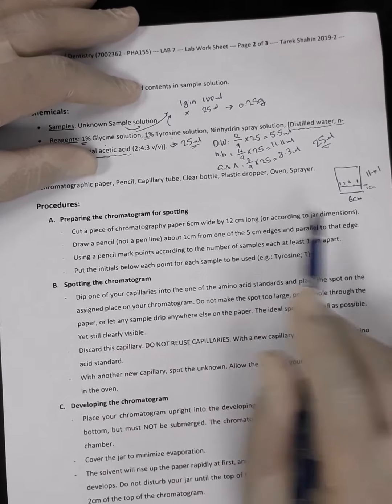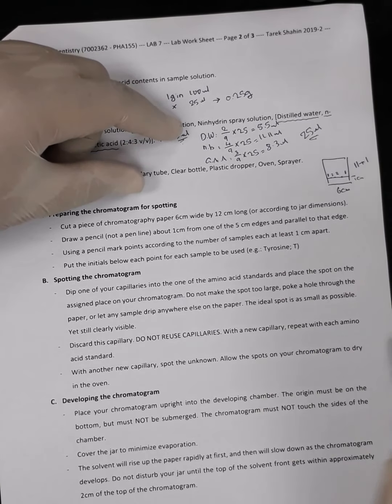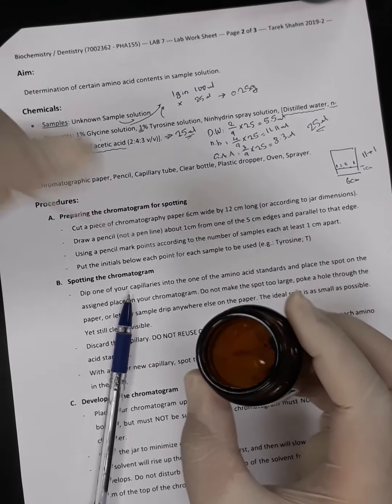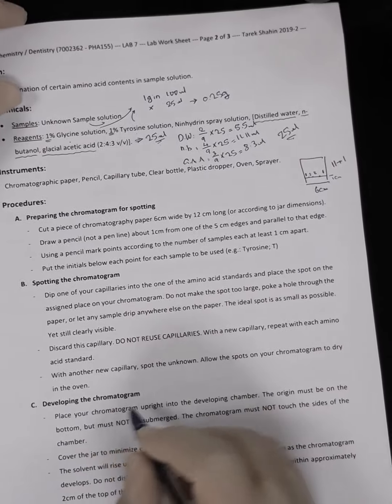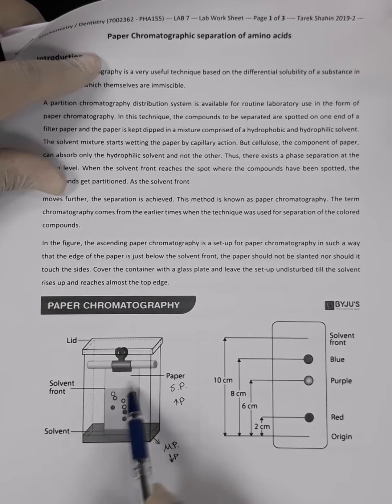Of course, when we cut the edges of the chromatogram, it is not allowed to just tear it with the ruler. We have to use the scissor to ensure the uniformity of the margins. Later, to spot the chromatogram, we will simply take from the solution we prepared, and we will take the sample using the capillary tube. This is the capillary tube we are going to use. Then development. What is the meaning of development? Development means the movement of the mobile phase over the stationary phase. When the mobile phase starts to climb up over that paper, we call this step development.